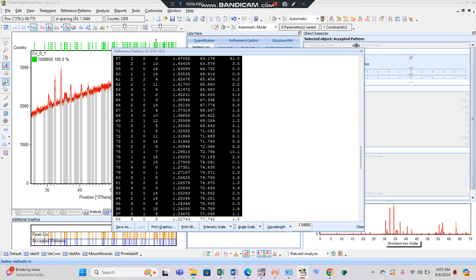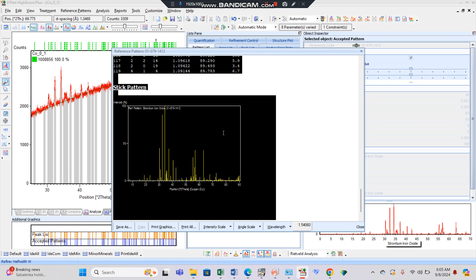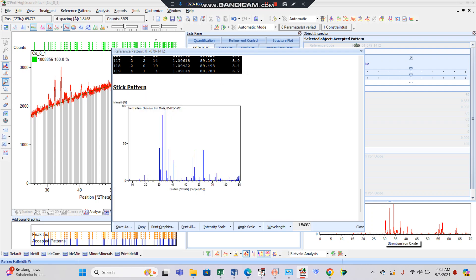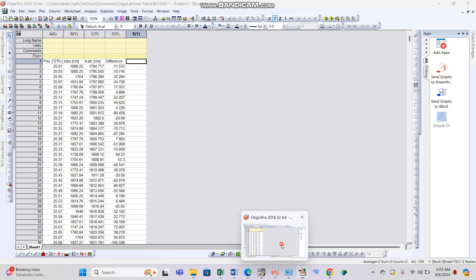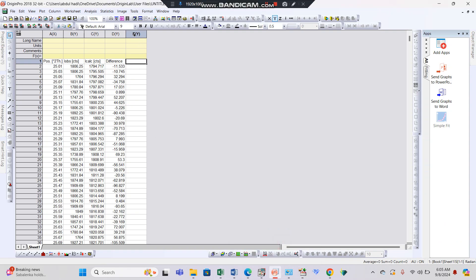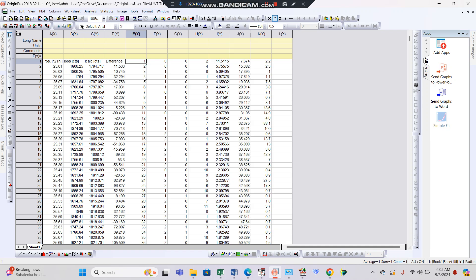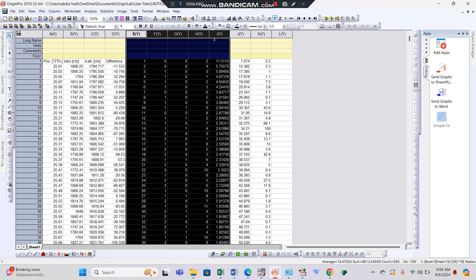Select all this data and then press Ctrl+C from the peak list. Then open the Origin file and place the cursor at the very next column, then press Ctrl+V. You can see all the data from the JCPD card which we copied from Expert HighScore is now placed here in Origin.